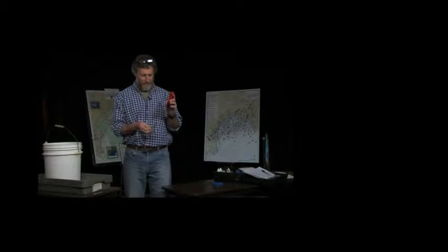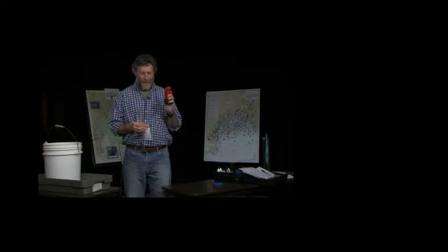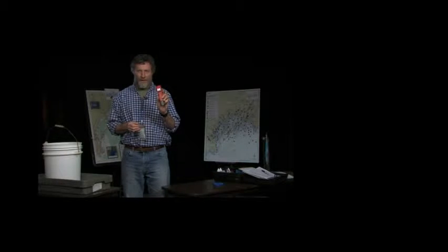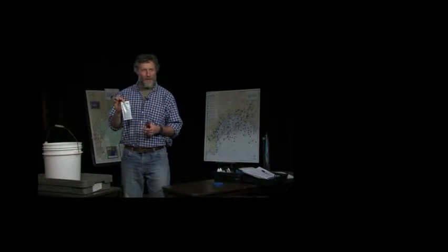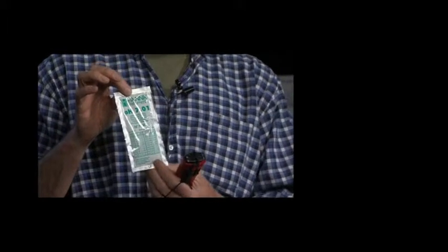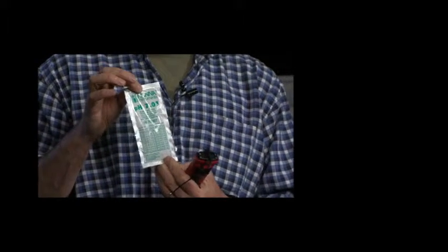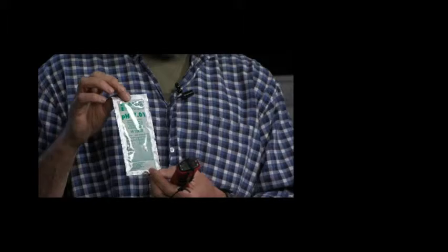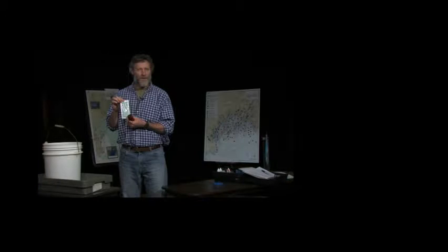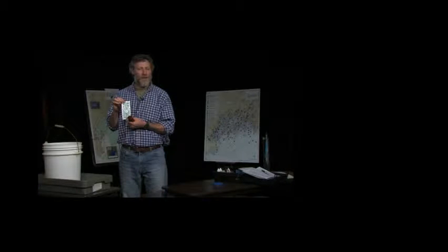So to calibrate this pH meter, we have the meter and we have a calibration solution. There's a variety of different calibration solutions. This is a 7.01 calibration, which is sort of a neutral pH.